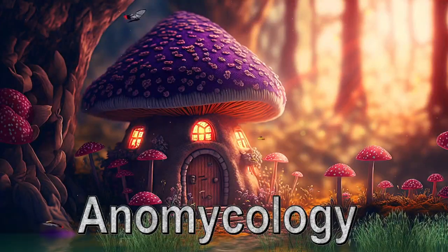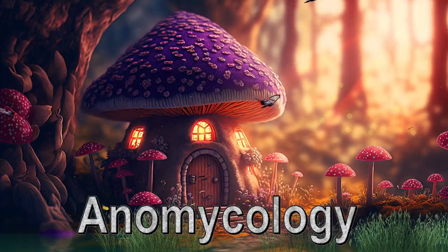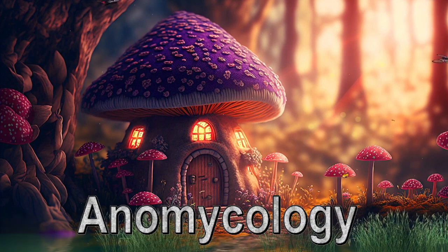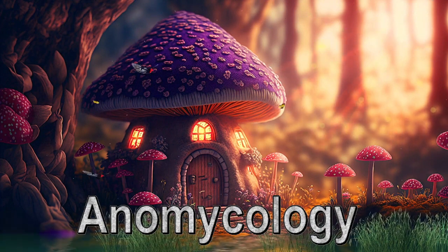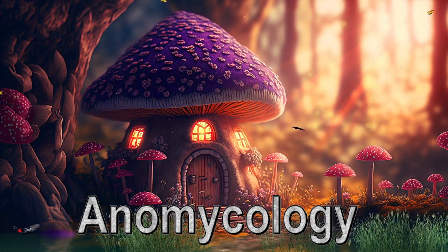What's going on guys? It's Anon Mycology. Today I'm going to be showing you how to create liquid culture base and how to inoculate your liquid culture base with selected genetics, giving you limitless culture syringes for future cultivation.